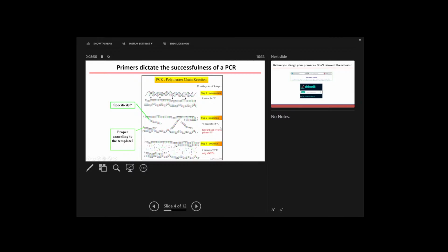Your primer should be specific to the template. For the gene you designed the primer against, your primer, actually two, forward and reverse, should have two binding points on that gene. That will define the boundary of the area which you will be amplifying. Right?